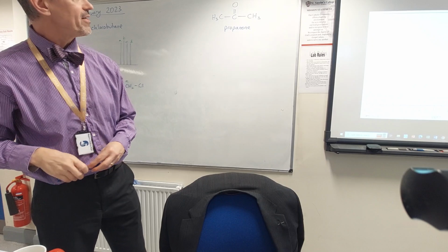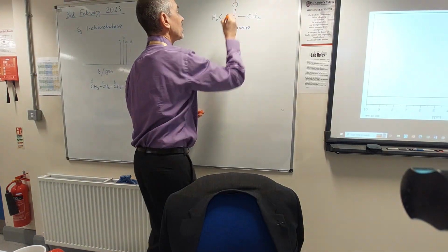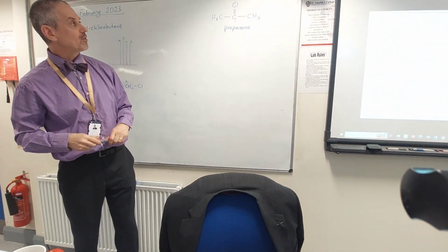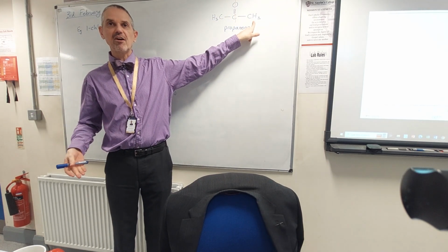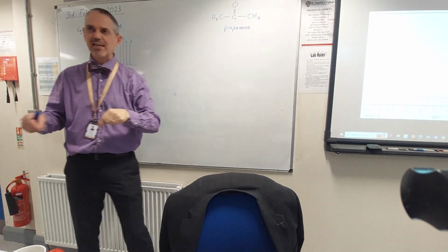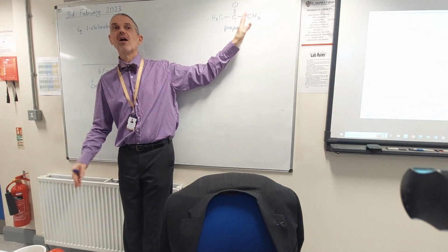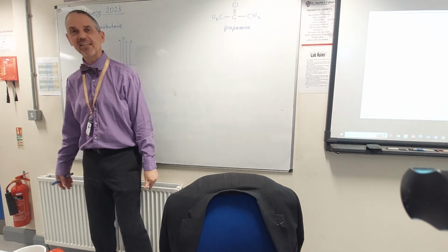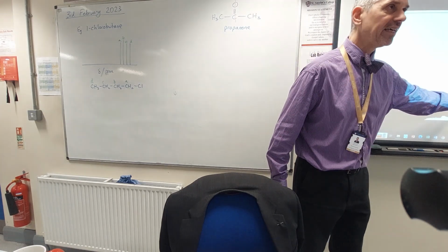Well, what's going on is that we've got a certain amount of symmetry in the molecule. The molecule's kind of symmetric either side of that carbonyl group. These CH3s and these CH3s are in the same chemical environment. And of course, all the H's in that CH3 are in the same chemical environment as well. So all 6 hydrogens in that molecule are in the same chemical environment. So in terms of unique chemical environments, we've only got 1. So we get 1 peak.